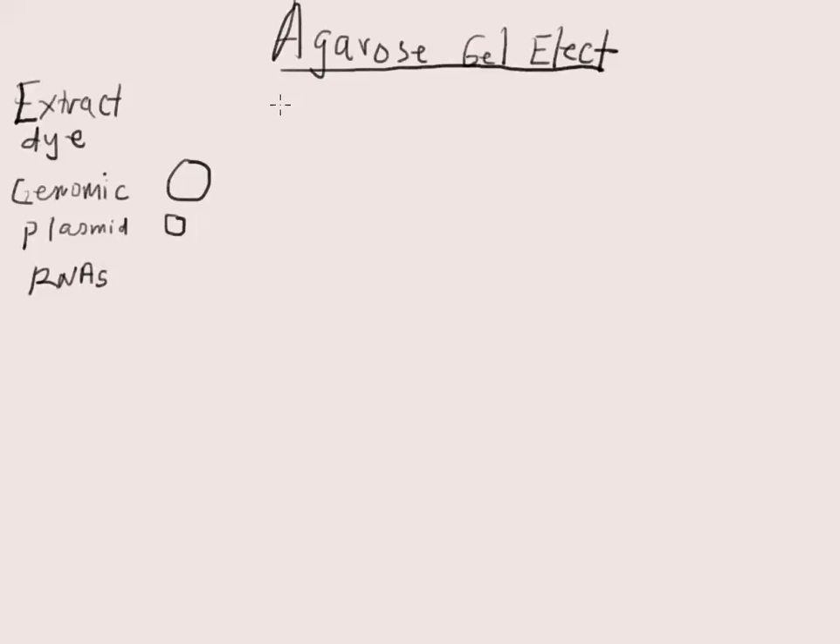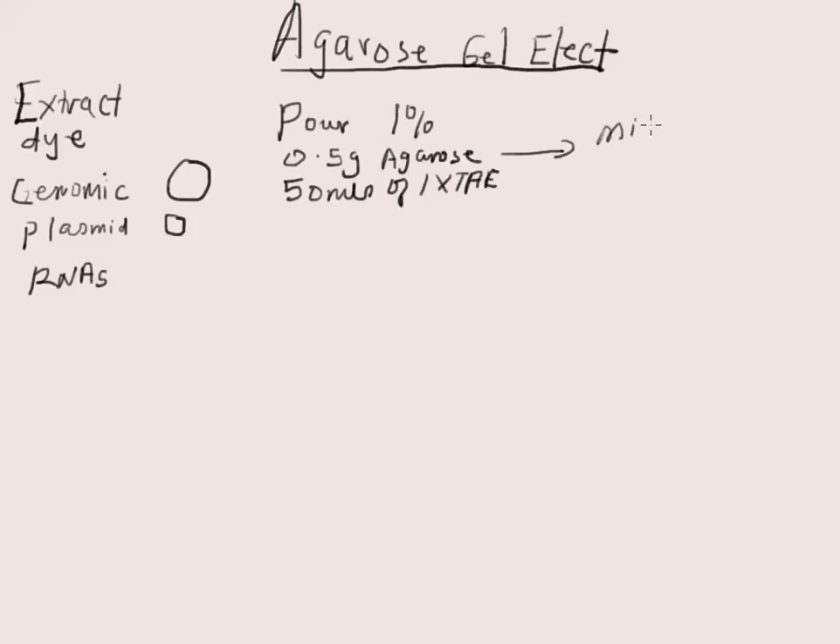What you do is pour a 1% agarose gel by weighing out 0.5 gram of agarose, then get 50 ml of 1x TAE, and microwave it to dissolve the agarose. Then cool briefly.